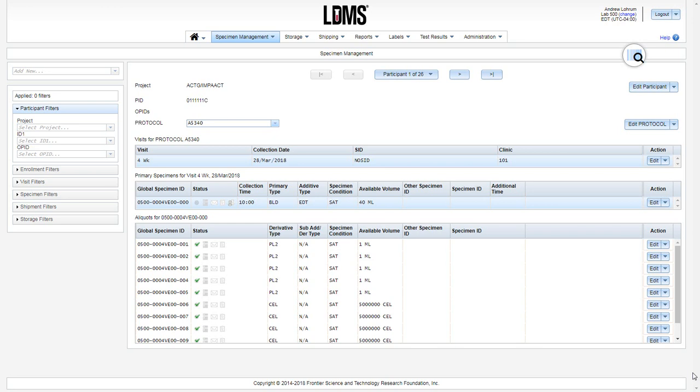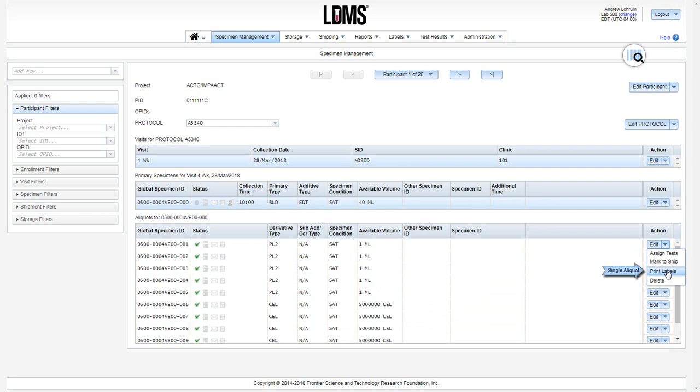In specimen management, you can generate labels in each of the three grids. In the aliquot grid, using this drop-down menu and selecting print labels will generate a label for an individual aliquot.